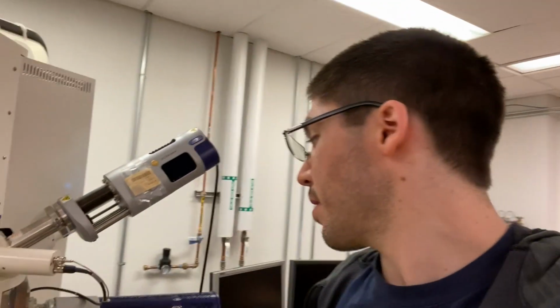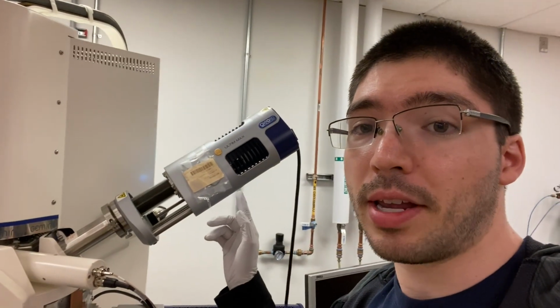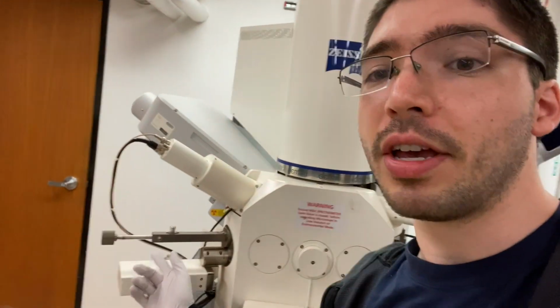So our X-ray detector, or the EDS detector, is right here. This can look at characteristic X-rays that come out of our sample as a result of interactions between electrons from the beam and our sample. We have our backscattered electron detector here. You can't really see it, we just insert it. And that's pretty much what I'm using when I'm looking at these samples.